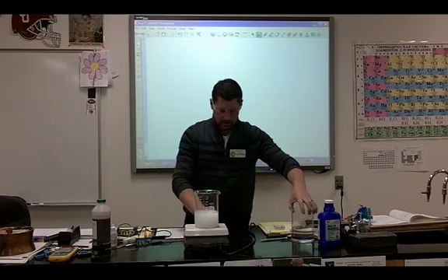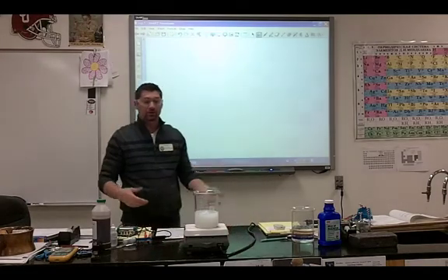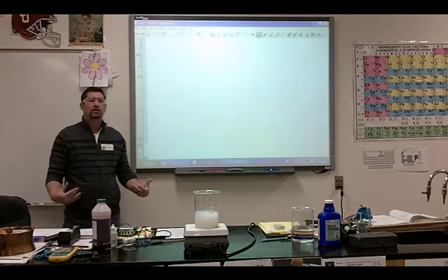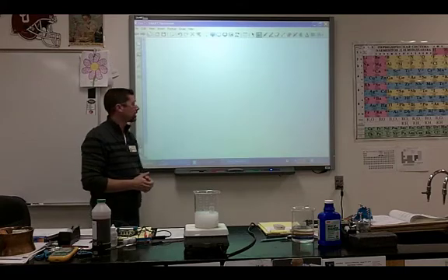Okay. And let me see if I can stir some of it a little bit. It's still very, very cloudy, isn't it? Yes. Okay, so it's still saturated. It's not soluble, it's insoluble.